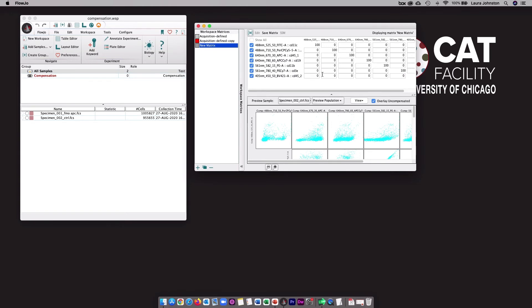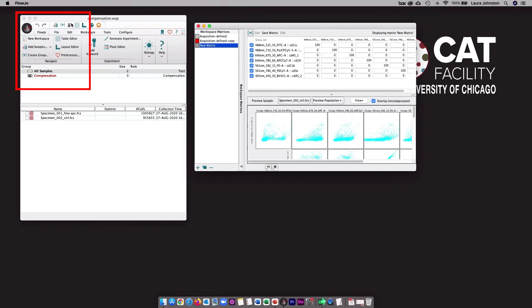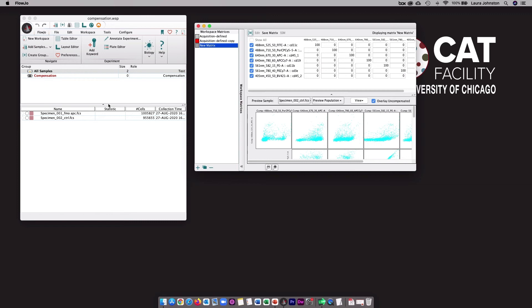Alternatively, you can use FlowJo's automated compensation tool. To do that, you'll first need to put your controls into this compensation group, and that will allow you to then use this button here, which will get you into the automated compensation tool. When you create a new matrix from the automated compensation tool, it will be listed in this list of matrices here, and you can also change the colors, apply them to the different tubes or groups, and if you really wanted to, you could make additional manual modifications to the matrix. Again, you need to make sure that any changes you make are scientifically appropriate.